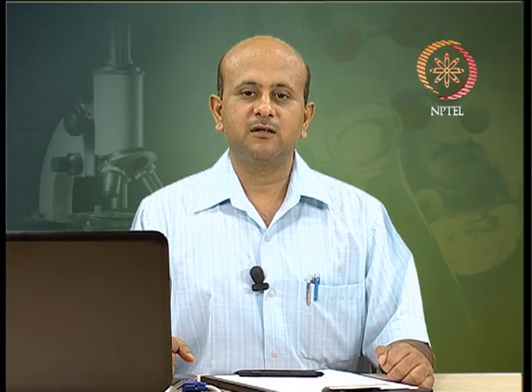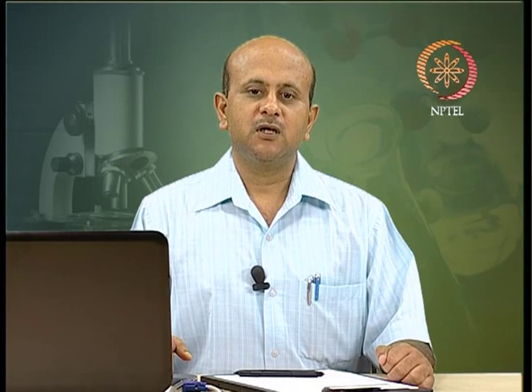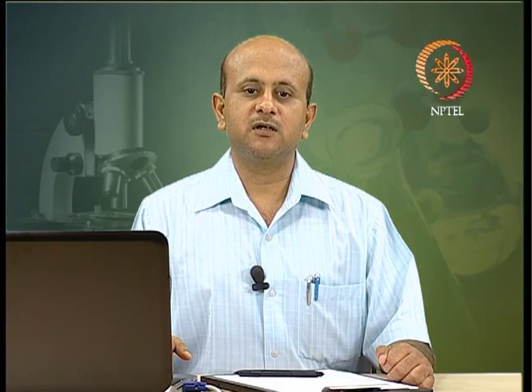As the concentration increases, the peak will also be different. So, measurement of sample concentration is done at wavelengths from the ultraviolet region to the visible region, say 200 to 800 nanometers, and particularly nucleic acids and proteins can be analyzed in the UV region.